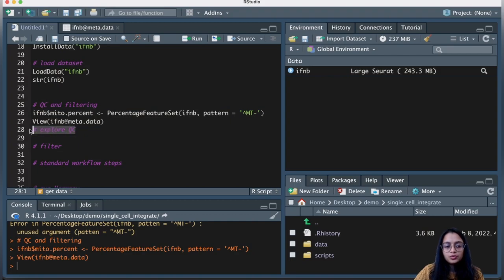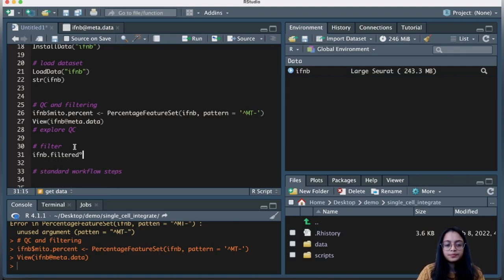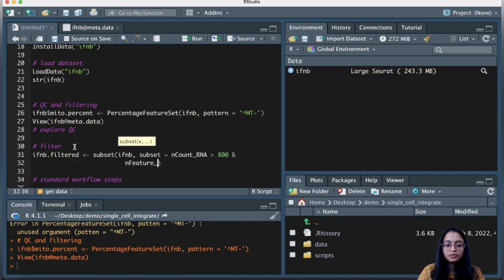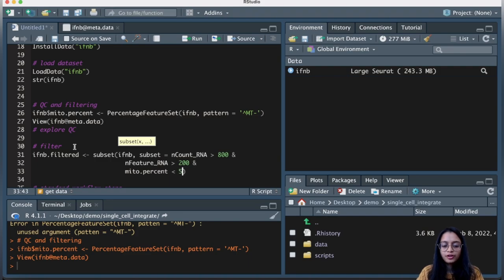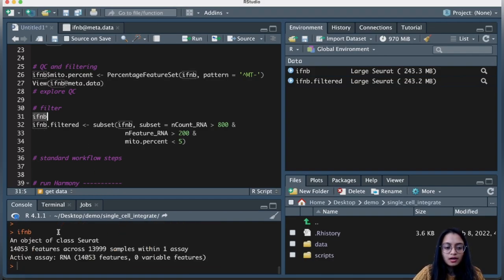I'm not going into the details of QC, but I encourage you to explore QC before setting thresholds. I know what thresholds to use, so I'll run the filtering now. I'm going to subset cells using filtering thresholds: keeping cells with transcript counts over 800, number of genes greater than 200, and mitochondrial percentage less than five percent.